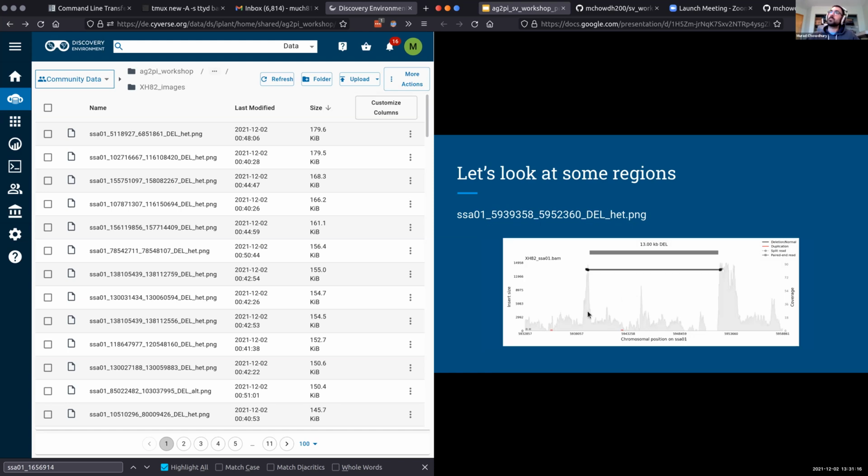But for example, this one seems to have a lot of discordant reads that are spanning the breakpoints at this large insert size, but it seems to have been confounded by the fact that there were these large spikes in coverage in between the purported breakpoints, whereas the midpoint here seems to have just normal-ish coverage that's a little bit noisy. This is more than likely just a false positive.